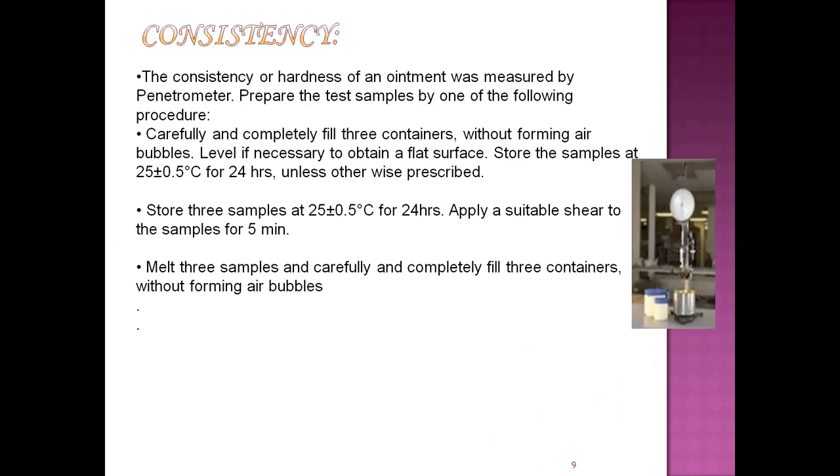Prepare the test samples by one of the following procedures. Carefully and completely fill 3 containers without forming air bubbles. Take 3 containers and fill the ointment, without forming any air bubbles. Level if necessary to obtain a flat surface. Store the samples at 25 degrees plus or minus 0.5 degrees centigrade for 24 hours unless otherwise prescribed. Then apply a suitable shear to the samples for 5 minutes. Then melt these 3 samples and carefully and completely fill the containers without forming air bubbles.